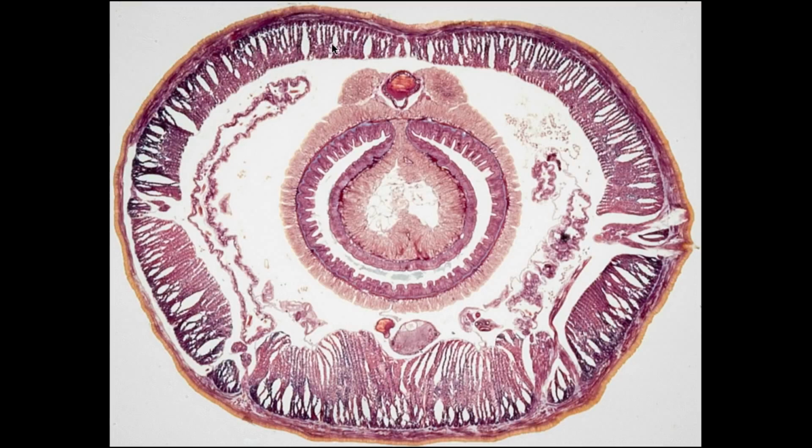You can't see any chetae in this model, but you can see in some locations where they would be if they were in this particular view. The white space, of course, is the coelom. And here is one of the two metanephridia in this section. The one on the right is not quite so clearly indicated. At the top is the dorsal blood vessel. This is the intestine with its lumen. And of course this is the typhlosole. Beneath the intestine we have the ventral blood vessel, and this structure is the ventral nerve cord.